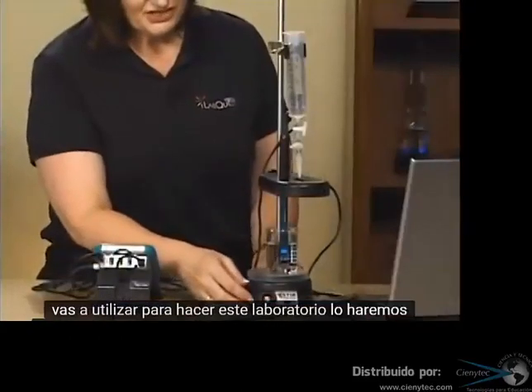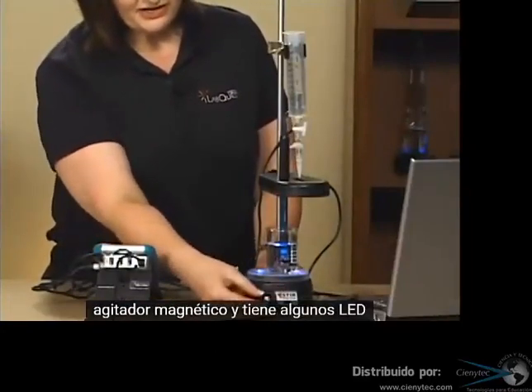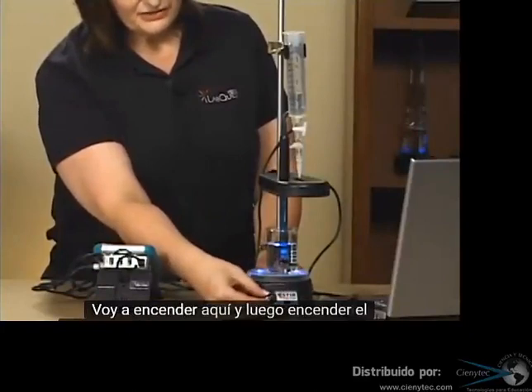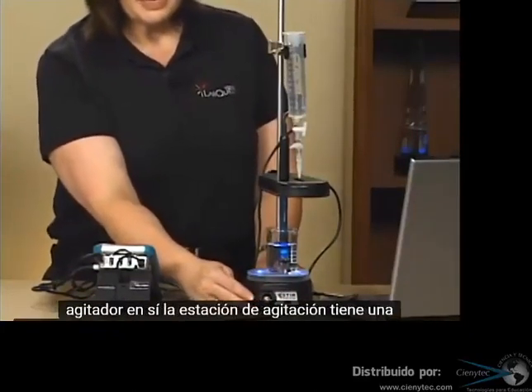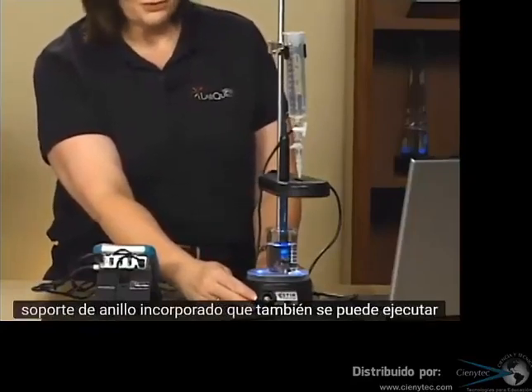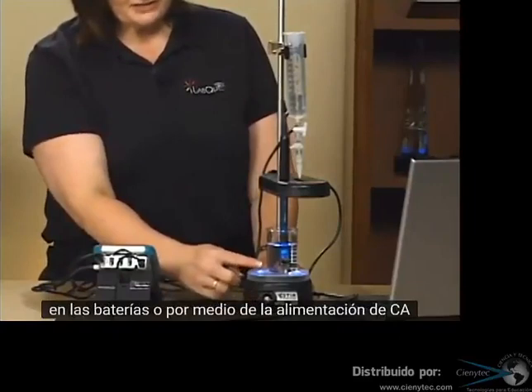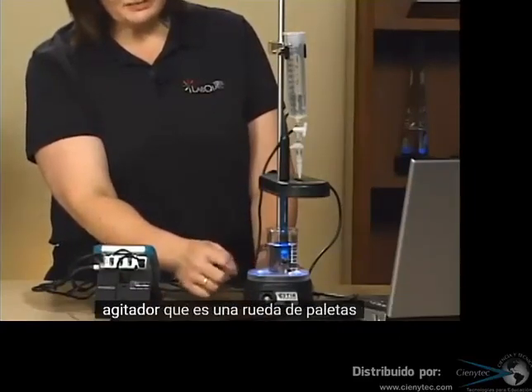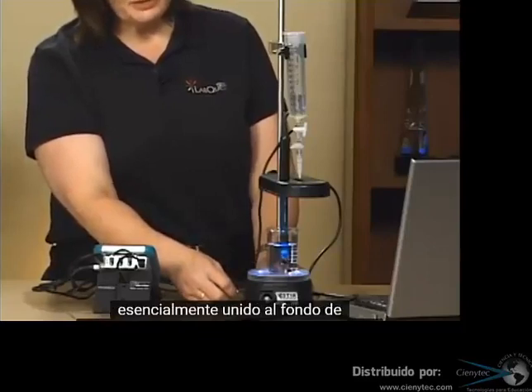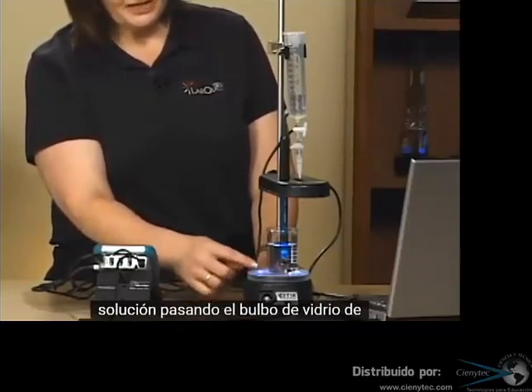We'll start with a stir station. This is our magnetic stirrer, and it has some LEDs I'll turn on here and then turn on the stirrer itself. This stir station has a built-in ring stand. It can also be run on batteries or through AC power. The stir station today is powering a little micro stirrer that's a paddle wheel essentially attached to the bottom of the pH sensor, keeping a good flow of the solution going past the glass bulb of the pH sensor.